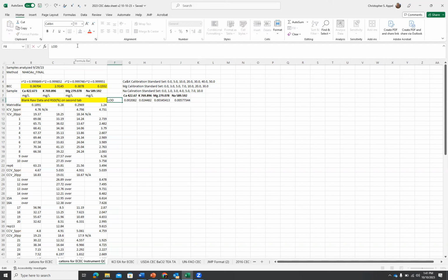Yeah. And the units are milligrams per liter. You want me to make it bigger?